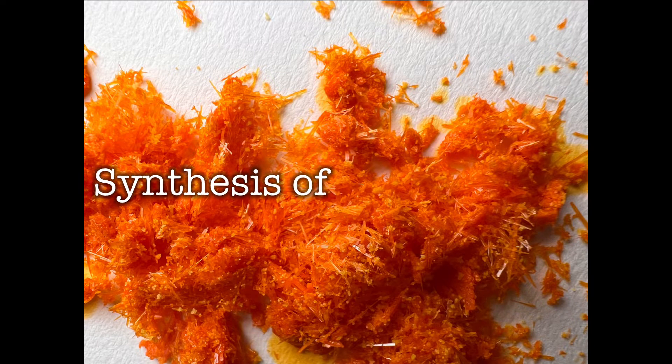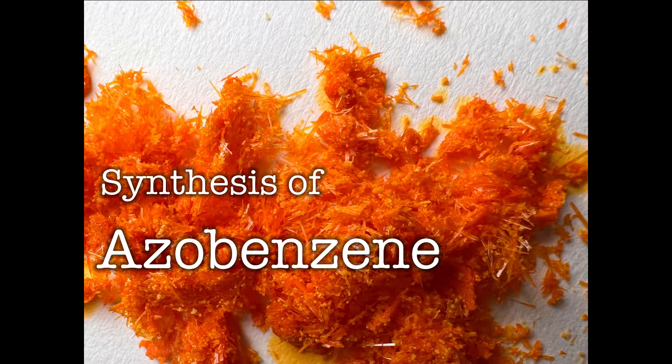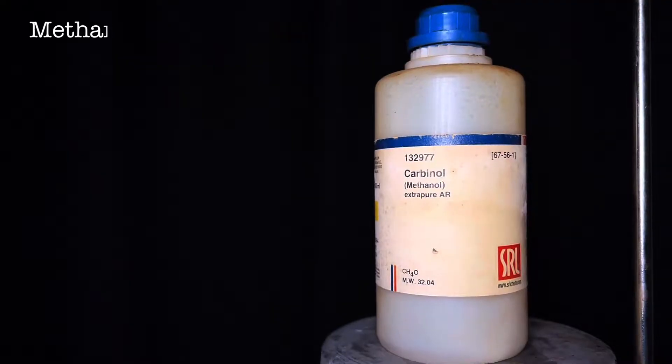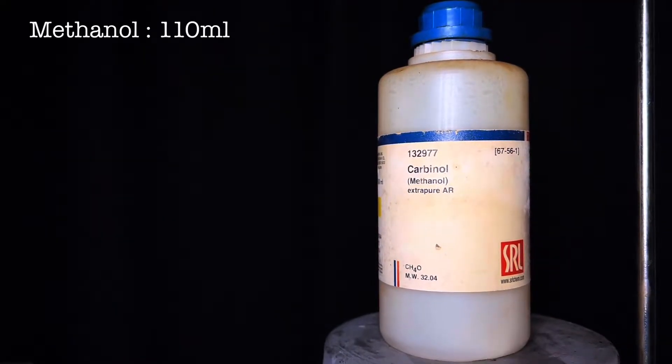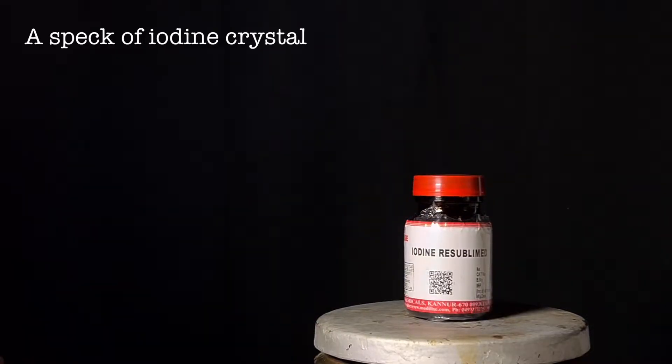Hello friends, in this video we will be synthesizing azobenzene by the reduction of nitrobenzene with magnesium metal. For this synthesis, we will need 6.2 grams of pure nitrobenzene, 110 ml of methanol, 6 grams of magnesium metal, and a small speck of iodine crystal.